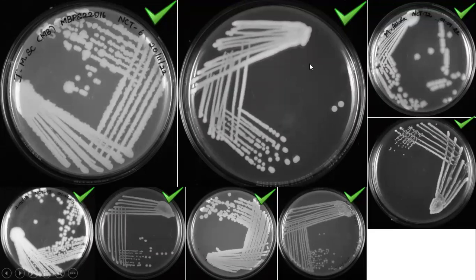So I would start from the mother line. I will make a thick bacterial smear. You incinerate the loop after that, cool it down. It's a simple word, but many times I see discontinuous growth because people are using a hot loop. So better touch the uninoculated area in the agar, transfer the excess heat if present in your nichrome loop, then go for quadrant streaking. I would suggest go for 6 lines from the mother line, incinerate, cool it down.